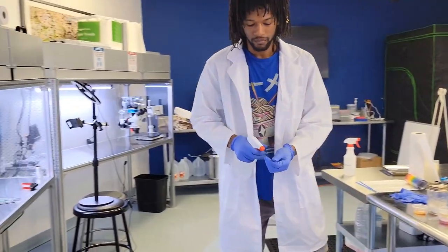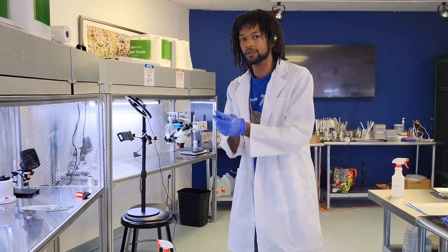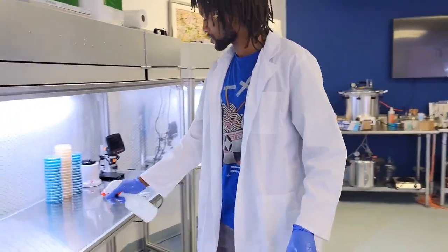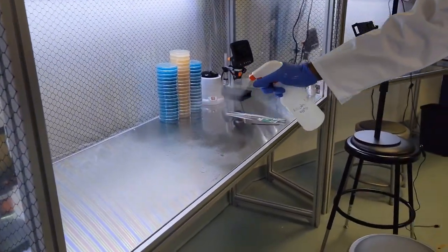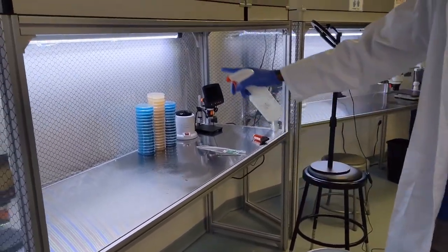Flow hood's on. 70% iso. So before I put things in my sterile space, I'm just going to lightly spray my area. That's going to evaporate because we've got the sterile air coming down from the top.